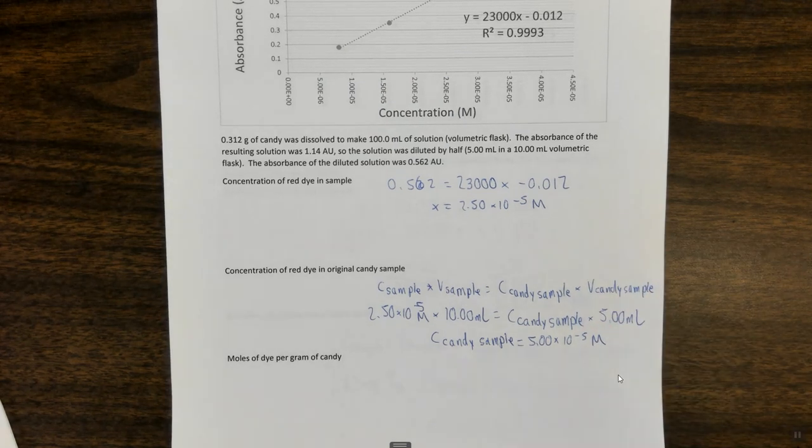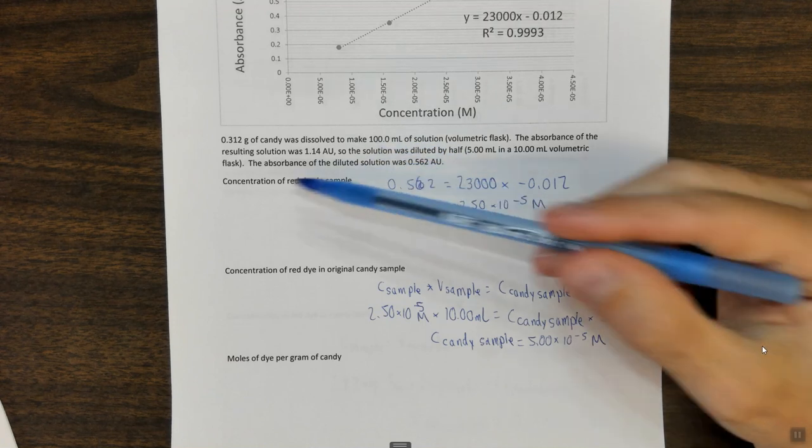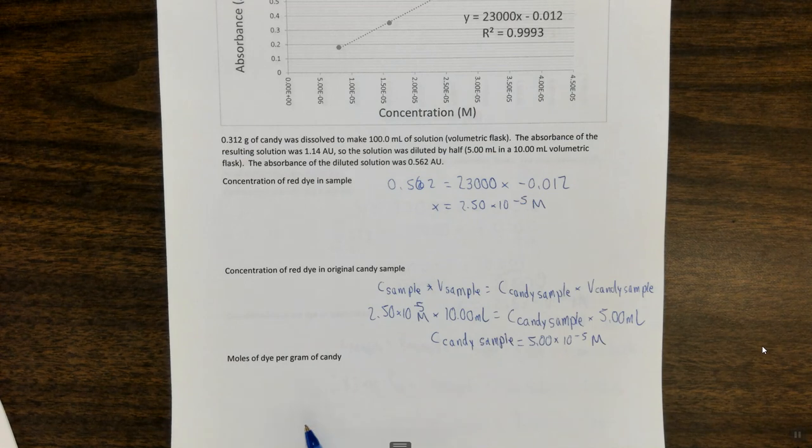All right, because I diluted it by half, the original sample had double the concentration. So now I have the concentration in the original candy sample where I took the 0.312 grams of candy and dissolved it in 100 milliliters of solution. Now, it asks for the concentration of dye in the candy.